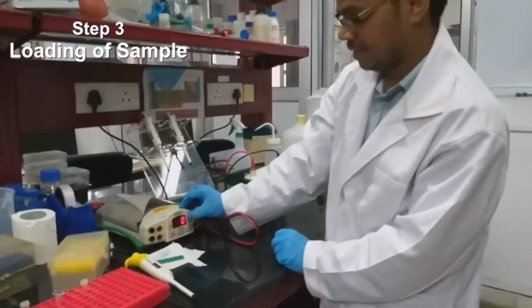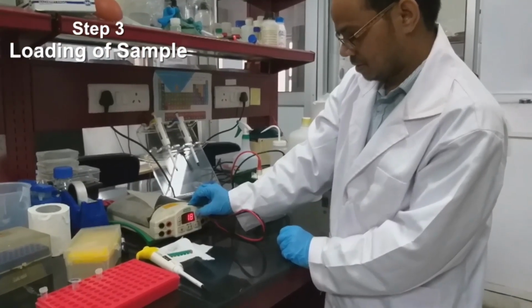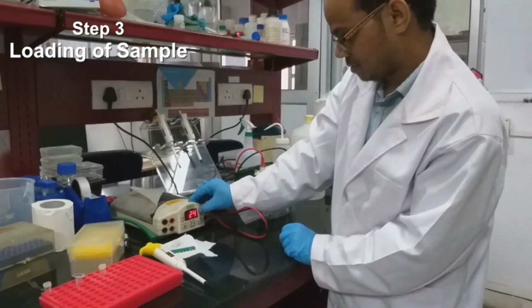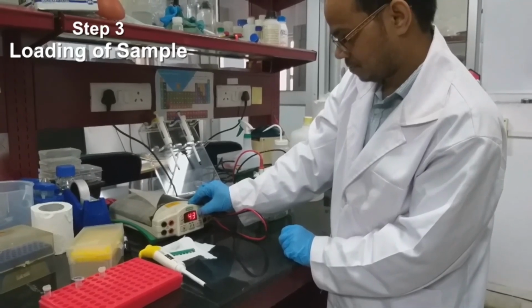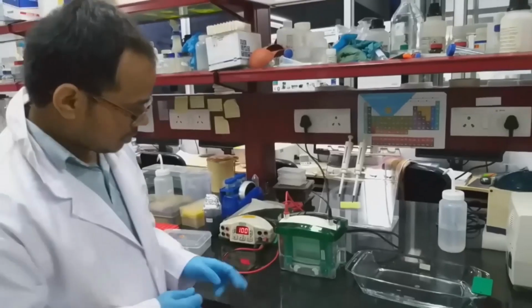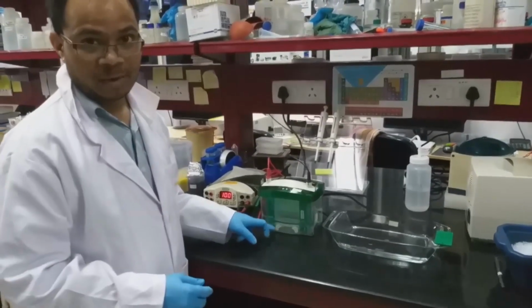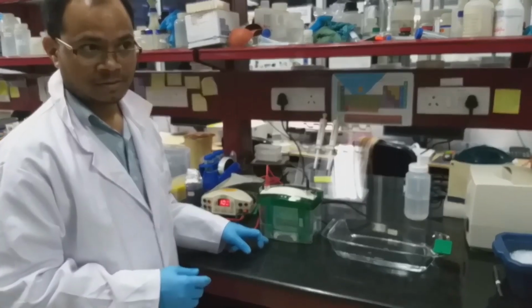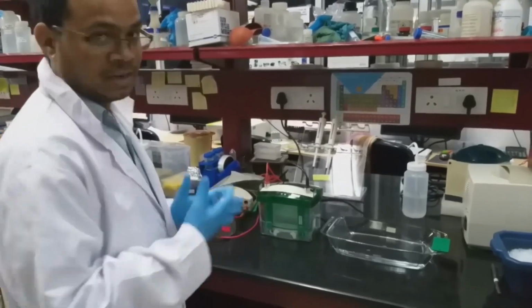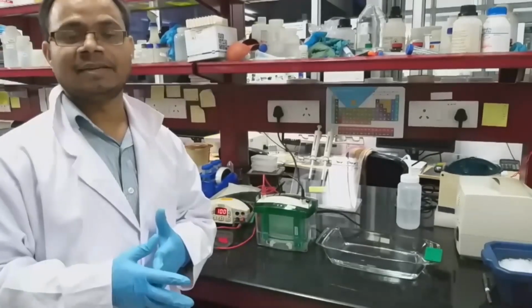I am going to set it at 70 volts. As we can see, it is almost over. So we can take out the gel, then we will stain and destain it.